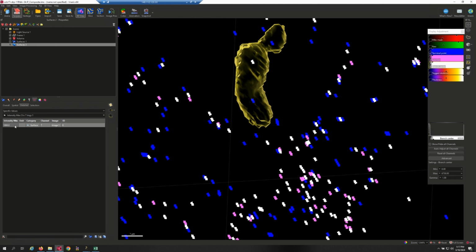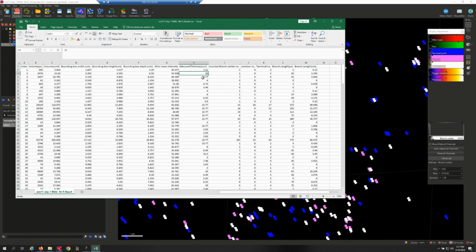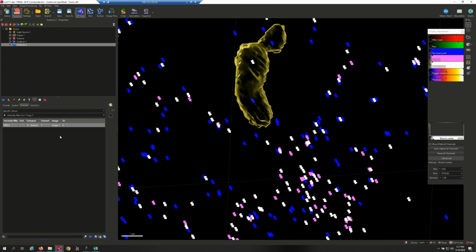This, and the number you see here, requires you to manually add a decimal point, 10.00. So why add a decimal point? Because most imaging software does not support floating point operations. Meaning, if there's a decimal point in our image, I can't set it up for multiple channels. So you'll need to manually add a decimal point after the 2nd digit.